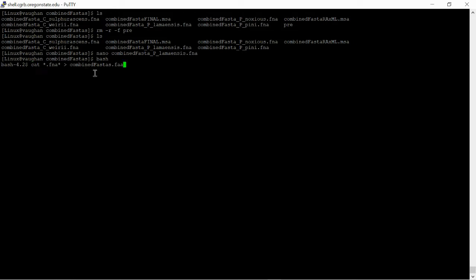We can use the cat command again. So this command, we're going to concatenate all the files that end in .fna into one final FASTA file called combinedFASTAs.faa.